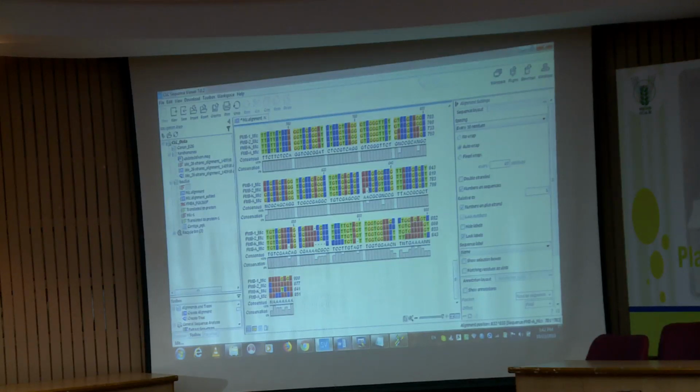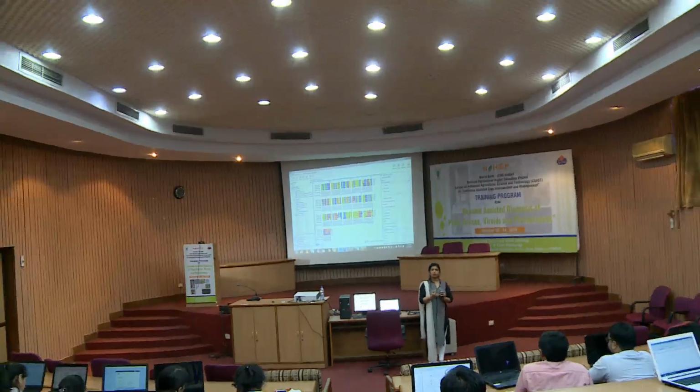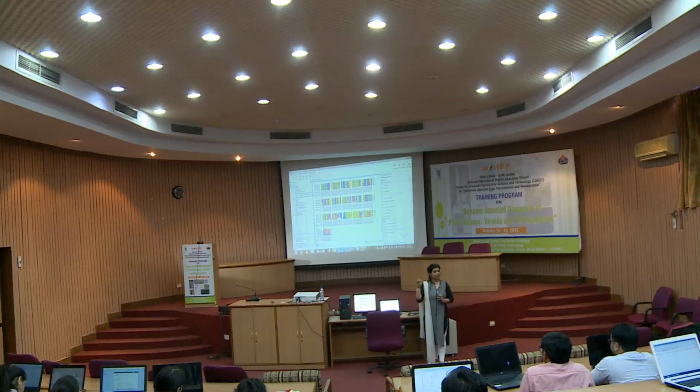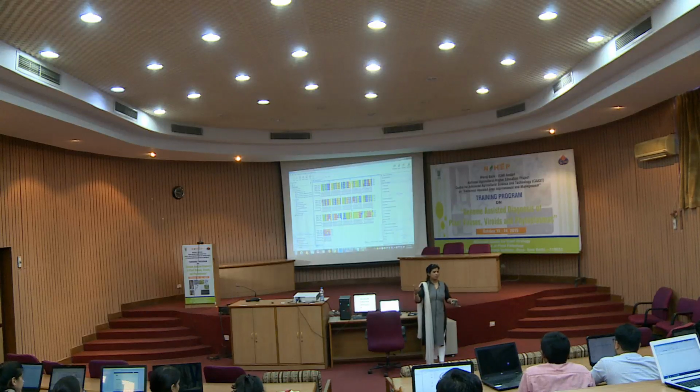Correct. Am I clear? So, now you are through with the trimming, you are through with the editing according to the chromatogram file. Please do not do the editing blindly, otherwise you will get confused about which base you deleted, because all seems to be similar. So, please do not do that.